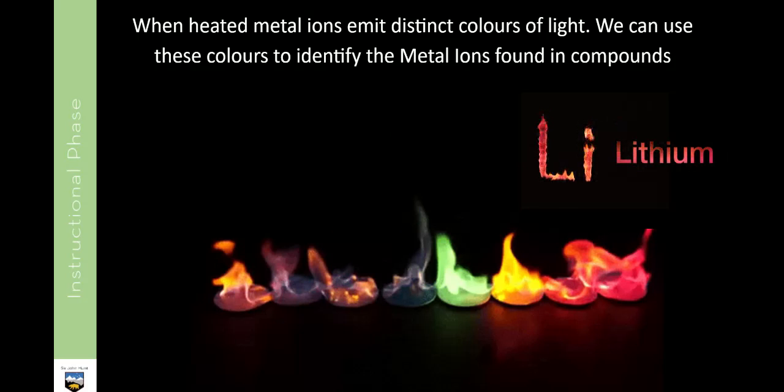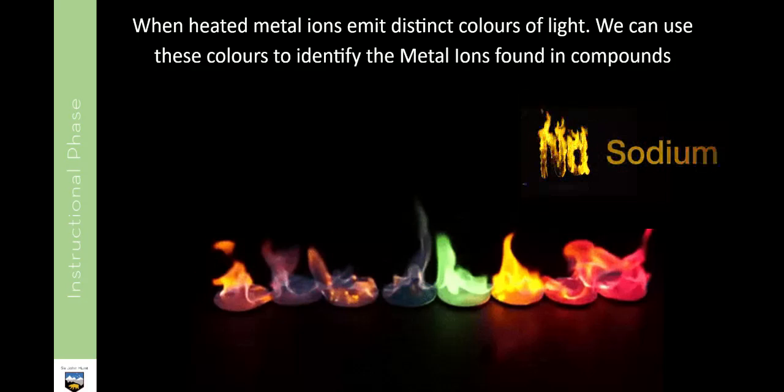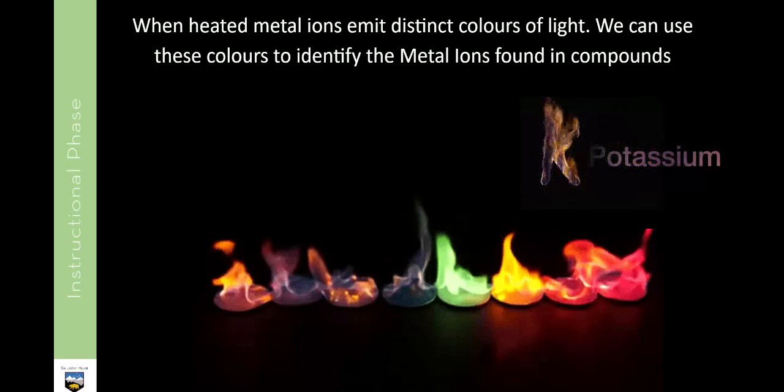Lithium, nice bright red colour. Sodium, when sodium ions are heated, they emit a yellow colour. Potassium, nice lilac colour.